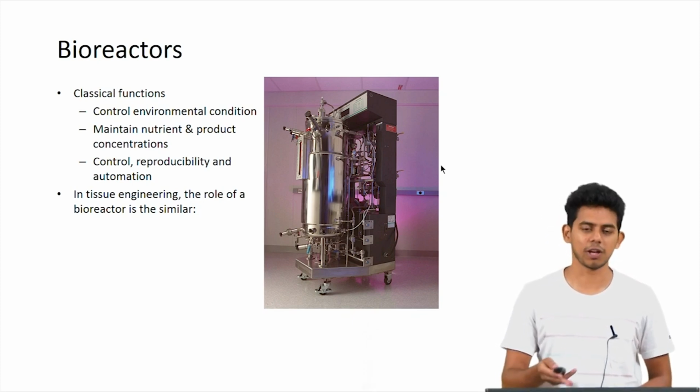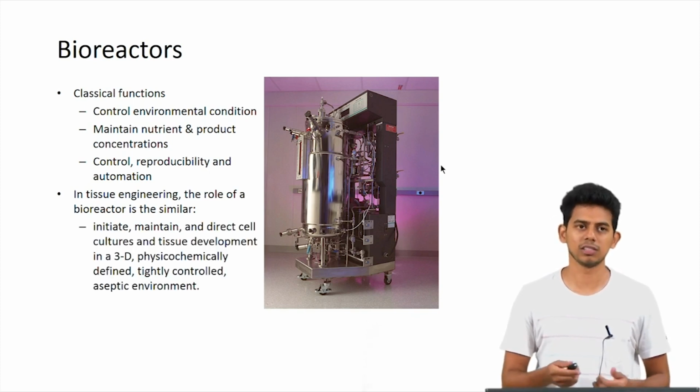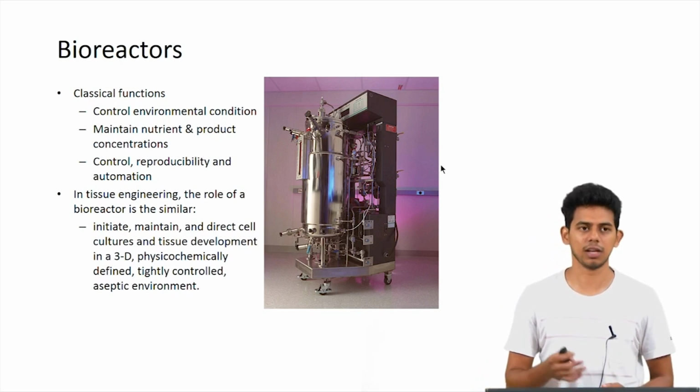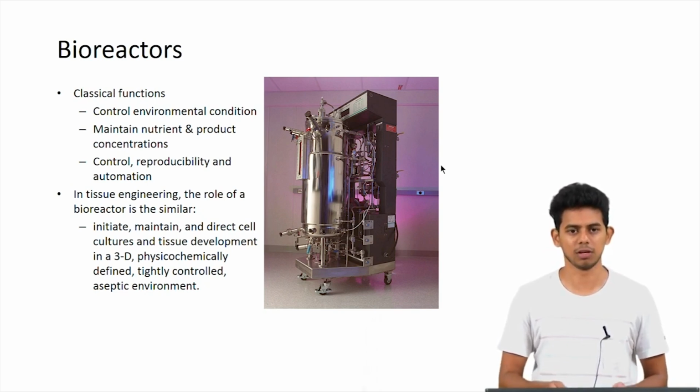The role of bioreactors in tissue engineering too is similar to what they are normally used for. So it is to actually initiate, maintain and direct cell cultures in a 3D environment by maintaining that environment and also the aseptic condition.